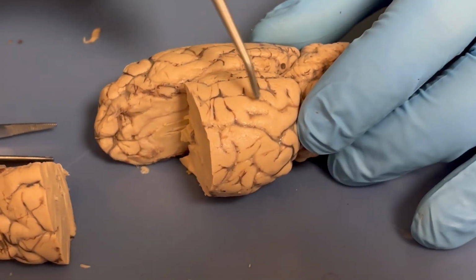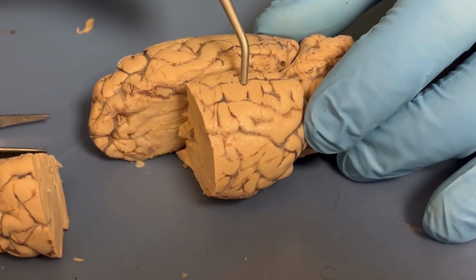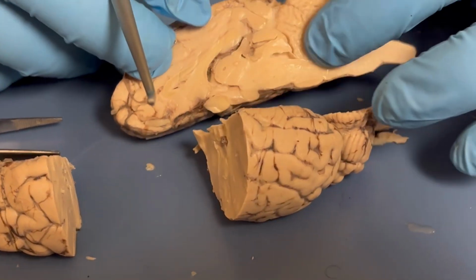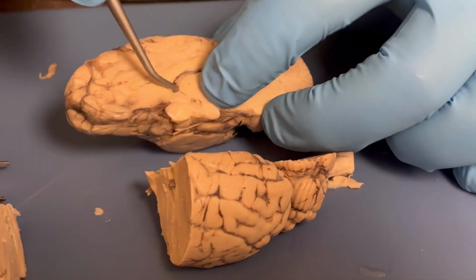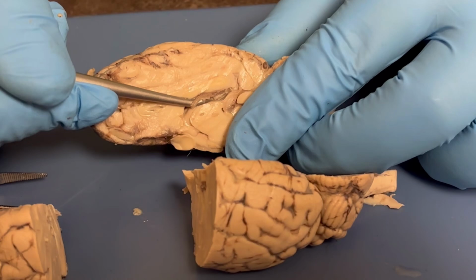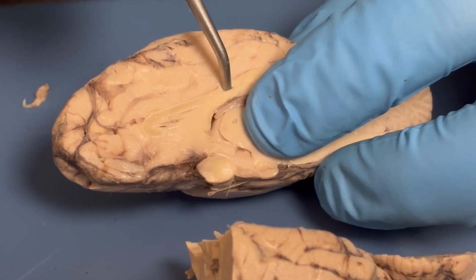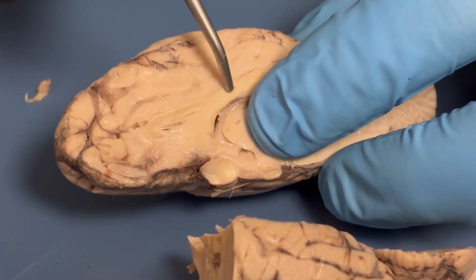Then we have the cerebrum. This contains parts of the brain that assist with voluntary movement, and it has parts of the brain responsible for maintaining homeostasis, specifically temperature. Then we can see the choroid plexus, which is located near the lateral ventricle, and it produces cerebrospinal fluid. Above that is the corpus callosum, and it surrounds the lateral ventricle, and it is responsible for allowing both hemispheres of the brain to communicate with both sides.